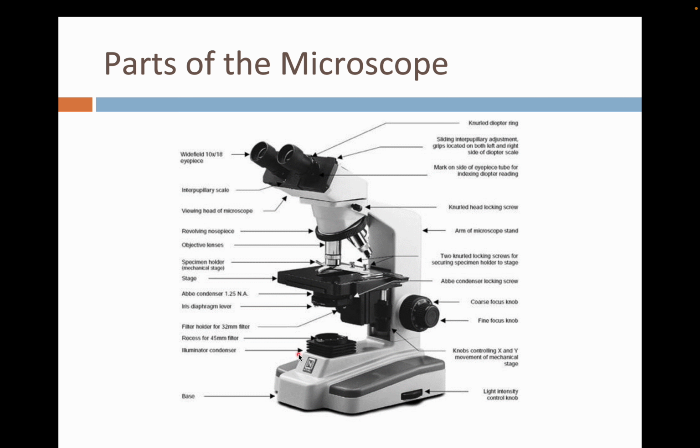I am expecting that in your biology courses during high school, you've probably been introduced to this already. And as you've mentioned that you had microbiology in your previous years, I'm hoping you're well aware of what parts of the microscope constitute the illuminating part, the magnification part, and the others for structural support or other functions.